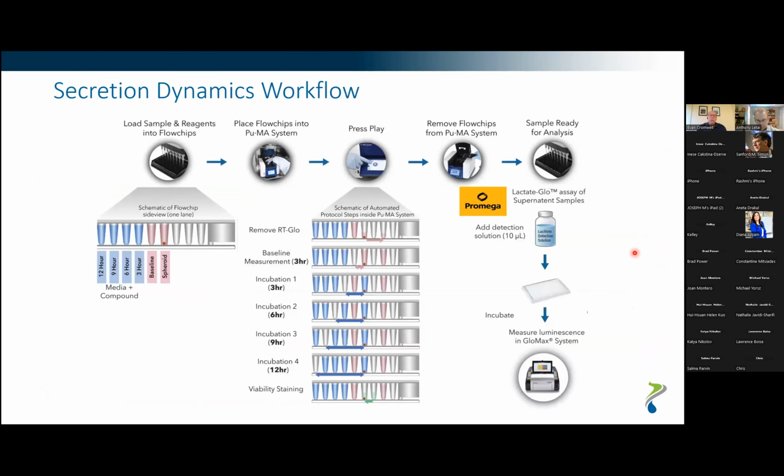For this, we wanted to look at glycolysis. And so for glycolysis, we looked at lactate secretion. We've been working with Promega. They have a very sensitive luminescence-based assay for lactate and for glutamate and other metabolites.